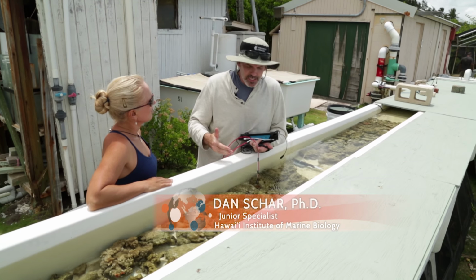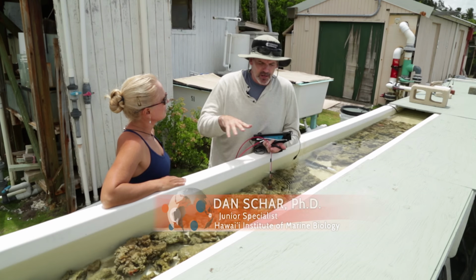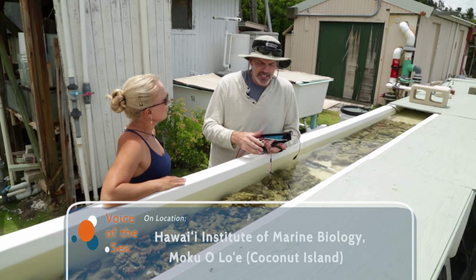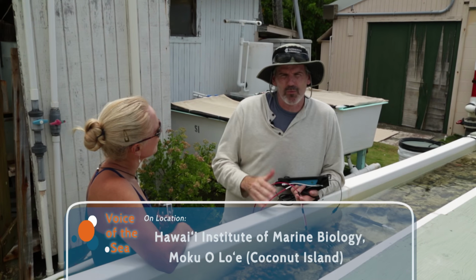So what you can see in a coral, if it has healthy pigments, you'll see one set of spectra coming off of it. And if there's something that maybe is dead, it's whiter, so you'll see a different spectra come off. We can start to use that information to quantify the health of coral in remote locations.